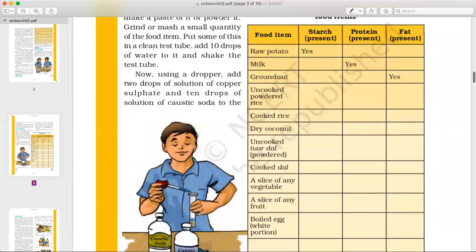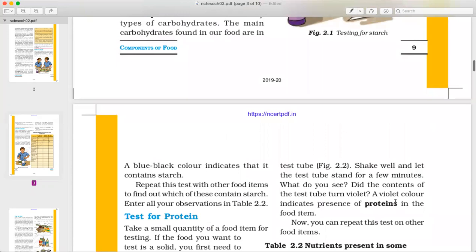Shake well and let the test tube stand for a few minutes. Now observe: did the contents of the test tube turn violet? A violet color indicates the presence of protein. The violet color is a symbol of protein.